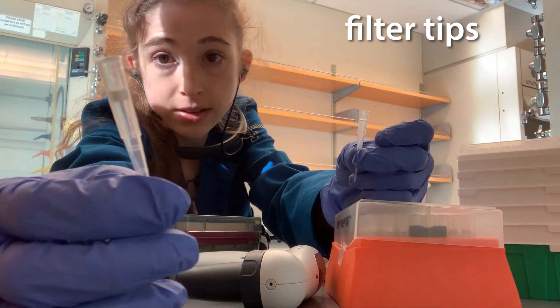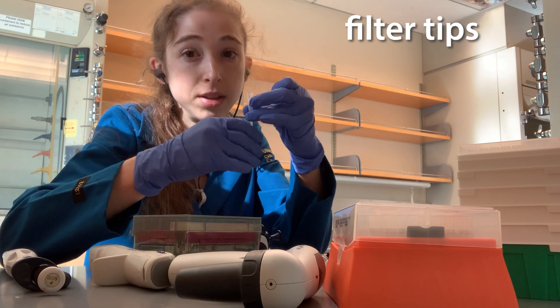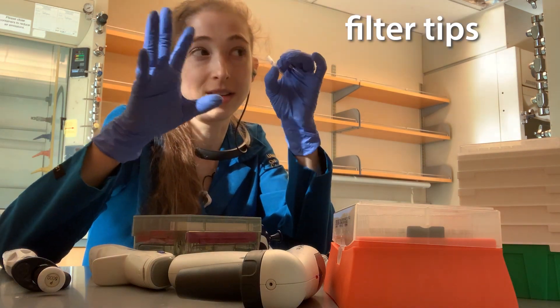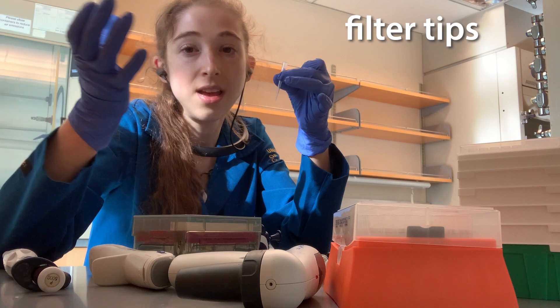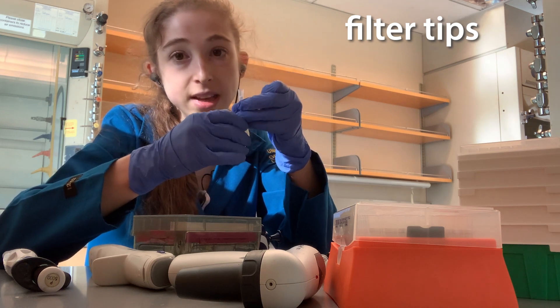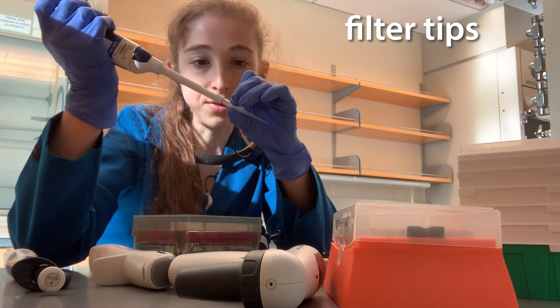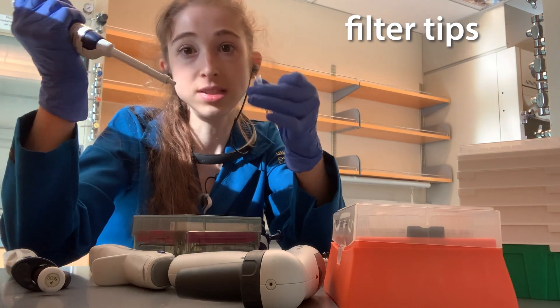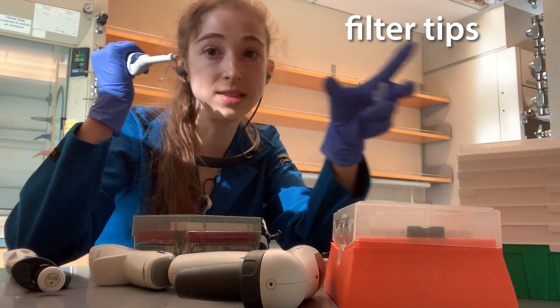Filter tips literally have a filter in them. This can be both to protect your sample from your pipette and to protect your pipette from your sample. A common time I use them is when working with RNA — there are RNases, which are like RNA-chewing proteins, that we secrete to kill invading viruses, but those can chew up the RNA we're trying to study. So filter tips help prevent anything that was on the top of the pipette from getting into your sample. You also have to worry about cross-contamination when working with DNA or sequencing.